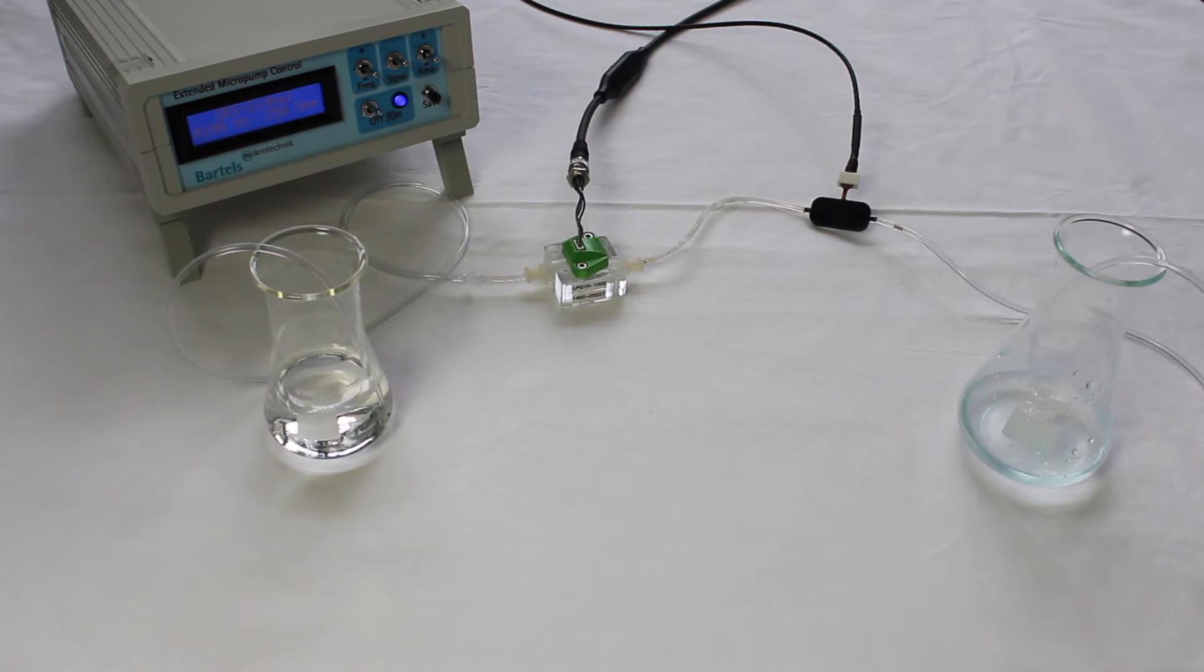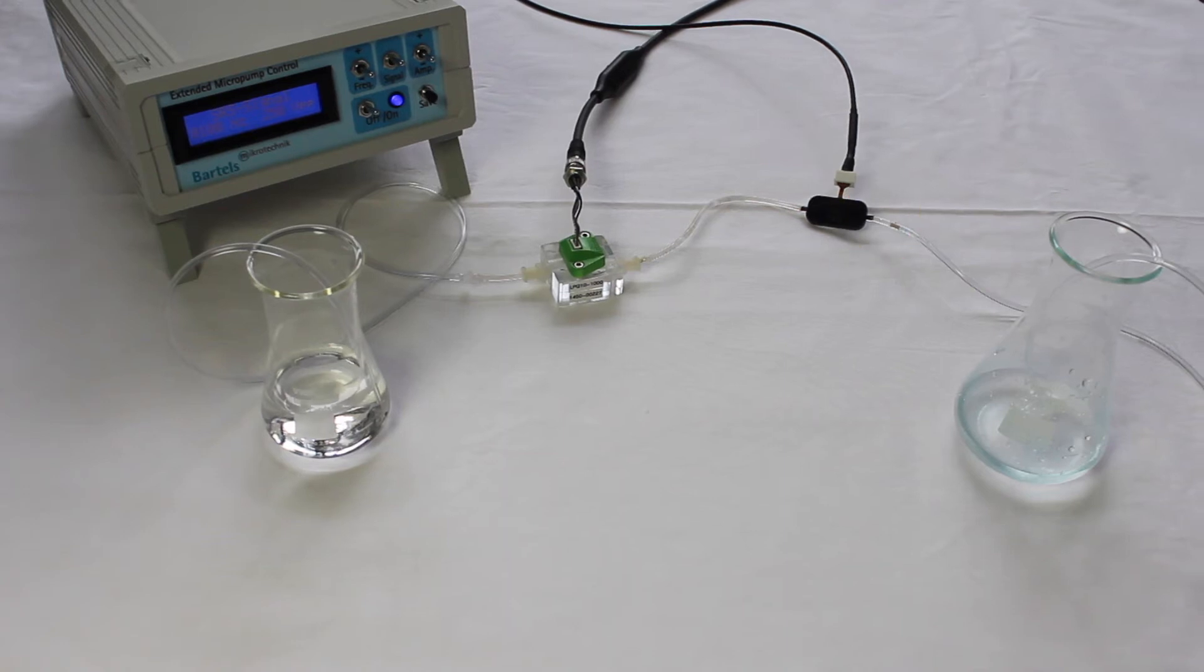When applying the restrictor, you preferably connect it to the pump exit. That way the flow rate is reduced by the fluidic resistance. With maximum amplitude and optimal frequency, the flow rate is only as high as the restrictor allows.